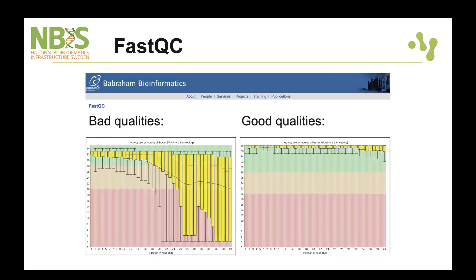Compare that to the good quality example, where the quality score remains well above 30 — even towards 40 — throughout the entire sequencing run and the entire length of the reads.